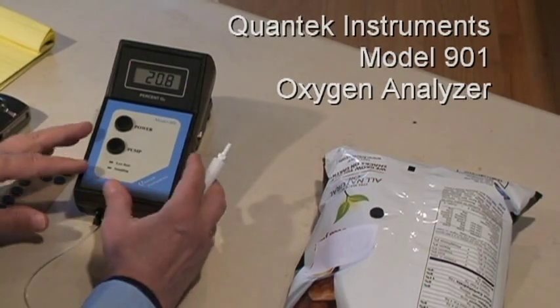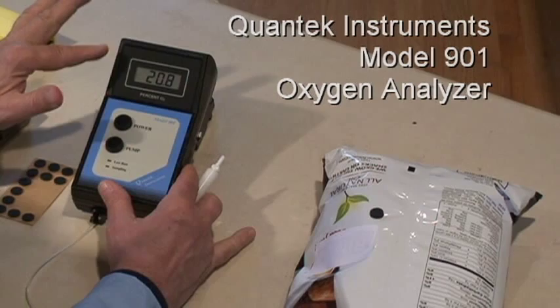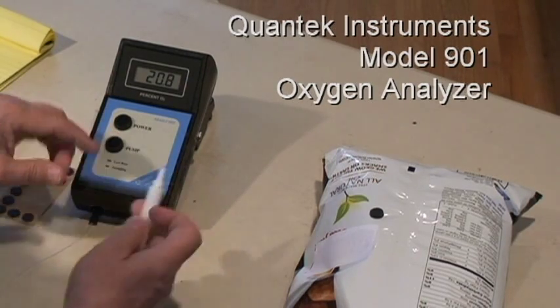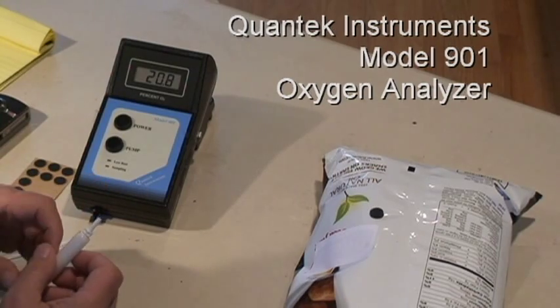The 901 is a small compact unit that's battery operated and very simple to use. It has an LCD readout at the top, a power switch, a pump switch, and a sample probe to which gets affixed a needle and a filter for sampling.